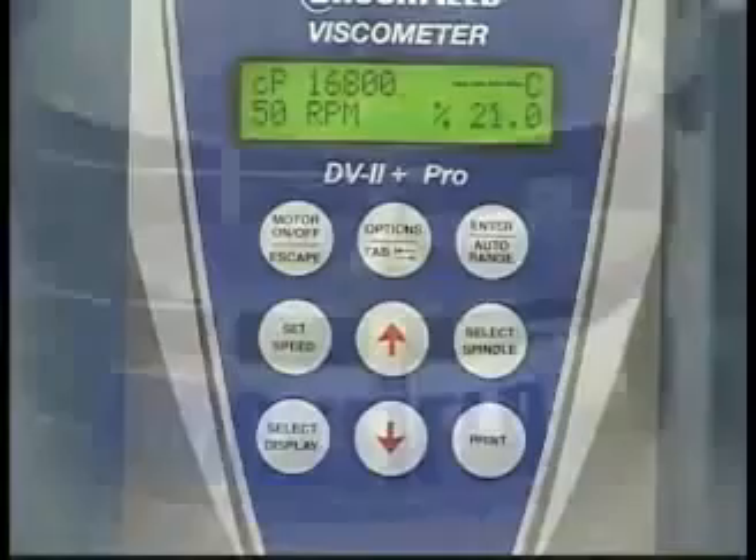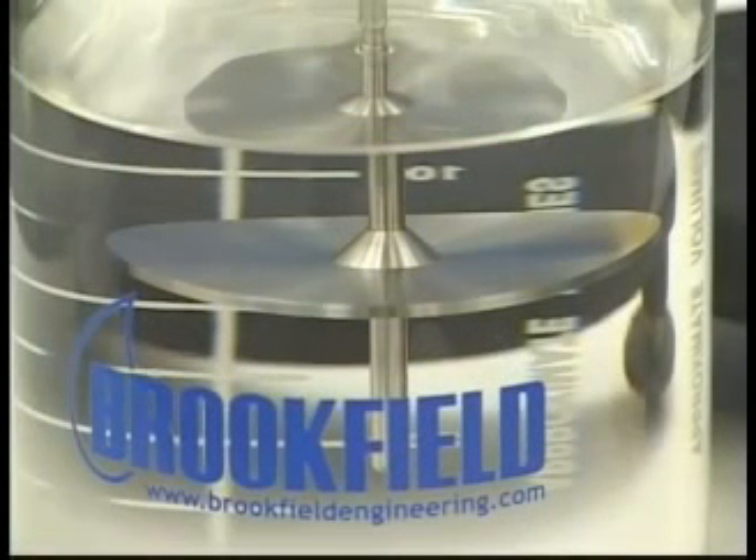Press the motor on button to rotate the spindle. If you need to take readings at multiple speeds, repeat the same process.